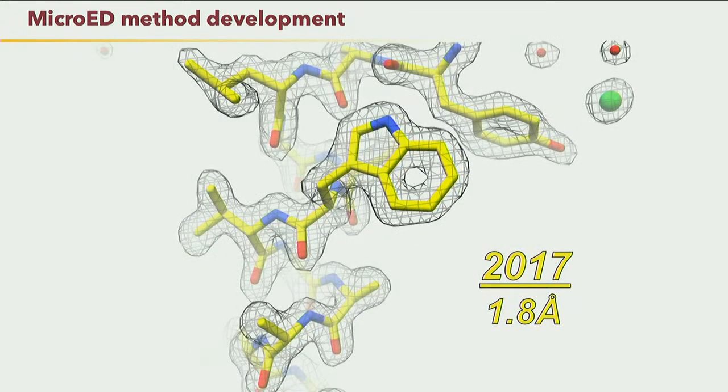A couple years later, lysozyme goes to 1.8 angstroms. And now there's a paper from my old group on bioRxiv that's going to come out soon, I think, where they coupled cryo-FIB milling to lysozyme, and they have a 0.9 angstrom structure of lysozyme, where they could use direct methods and see all the atoms in lysozyme. So really, this is not a mature field. X-ray crystallography isn't mature either, but it's had time to develop, and it's pretty good. We're still working on things.